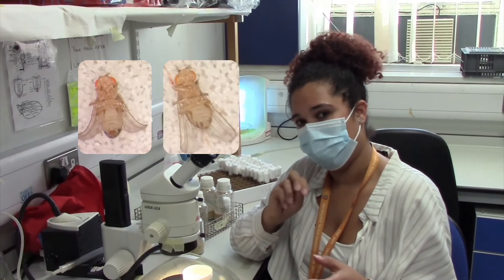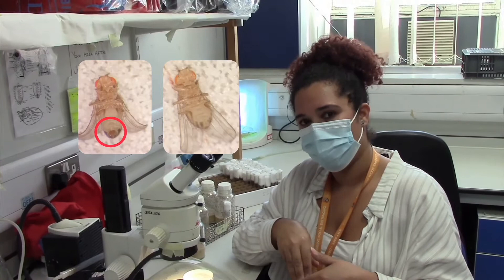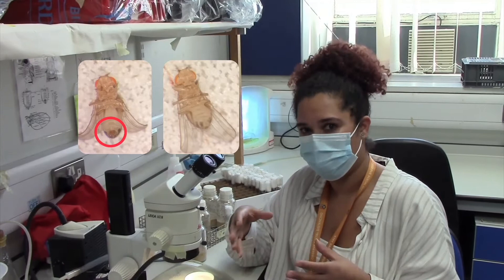The male is normally slightly smaller than the female and it has a dark abdomen, and if you look at the tip of the abdomen it has a plate that is the genitalia, while the female doesn't have this and is slightly bigger in size.